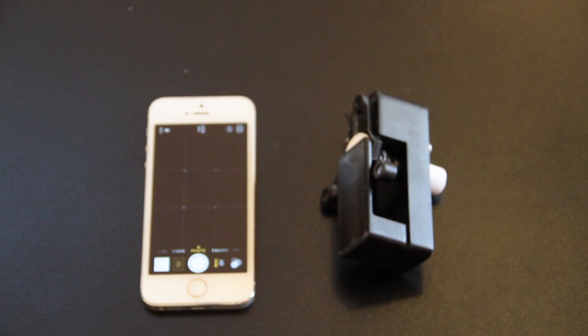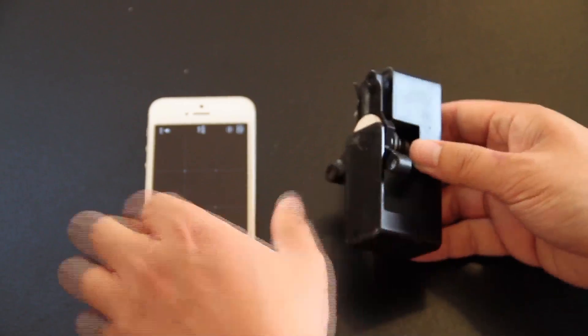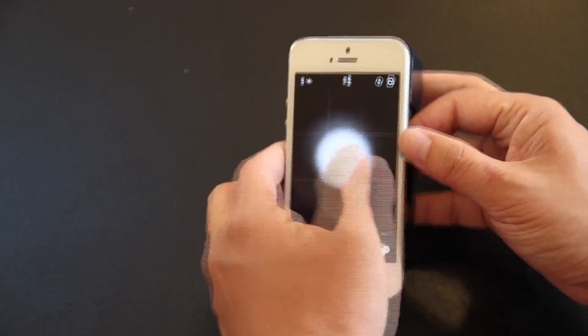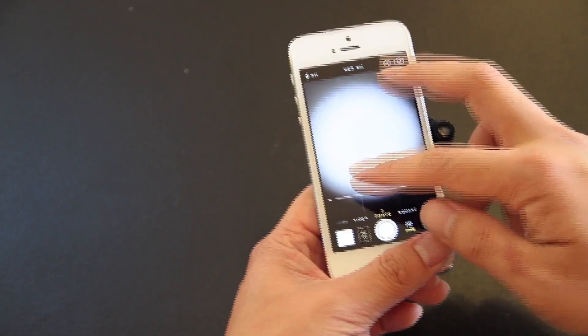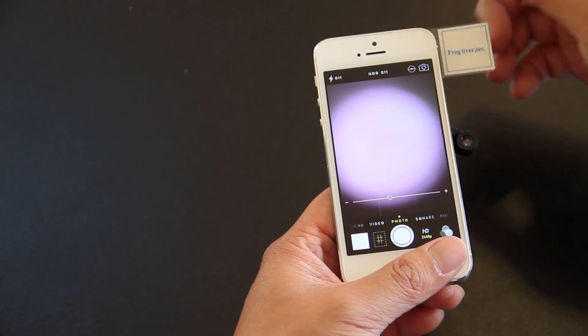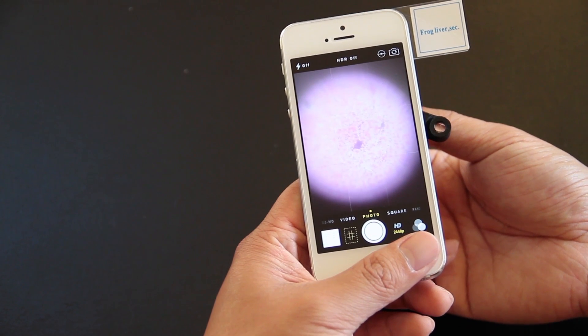Plus it's accessible not only in terms of size, weight, and cost — it's also just really easy to use. I just turn on the light on the microscope and switch to the camera app to help line up. Then I like to give it an extra press down to make sure it's secured and zoom in a bit. Then I put the sample on the stage, which works with or without a slide. And finally, I use that white knob to focus the image.